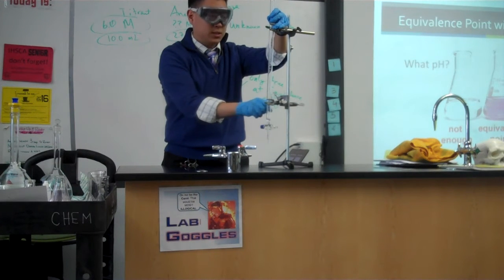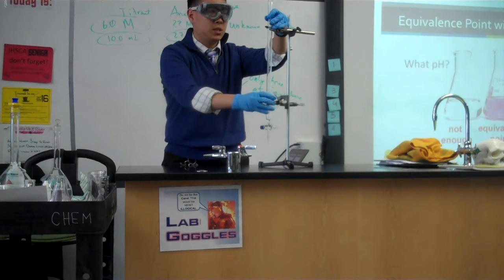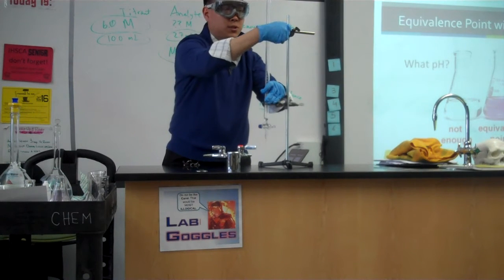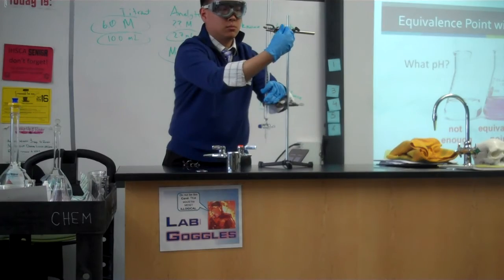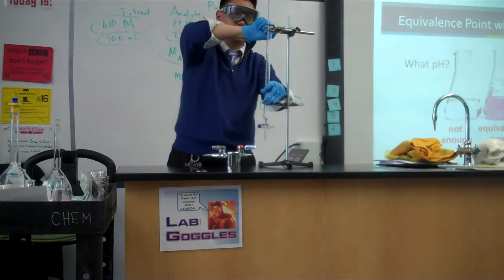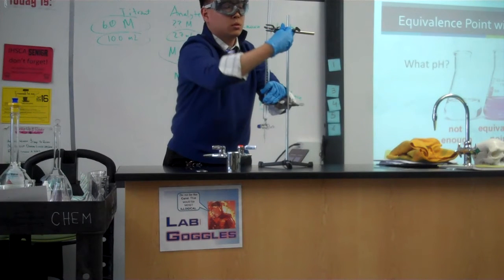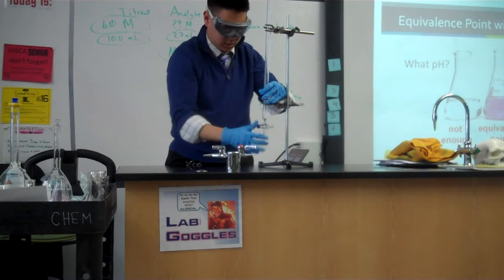Alright. Now, since this is made of glass, it is going to be somewhat sensitive, so you want to be careful when you're tightening these arms. You don't want it to be too tight because it might shatter, but it's not that thin that we have to really truly worry about. Alright, so nice and snug.